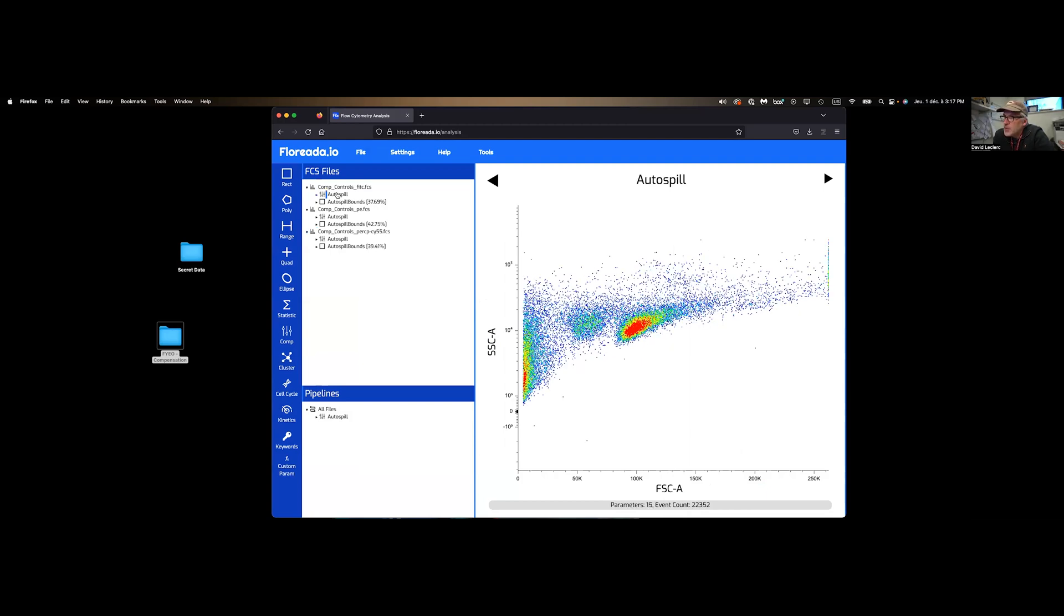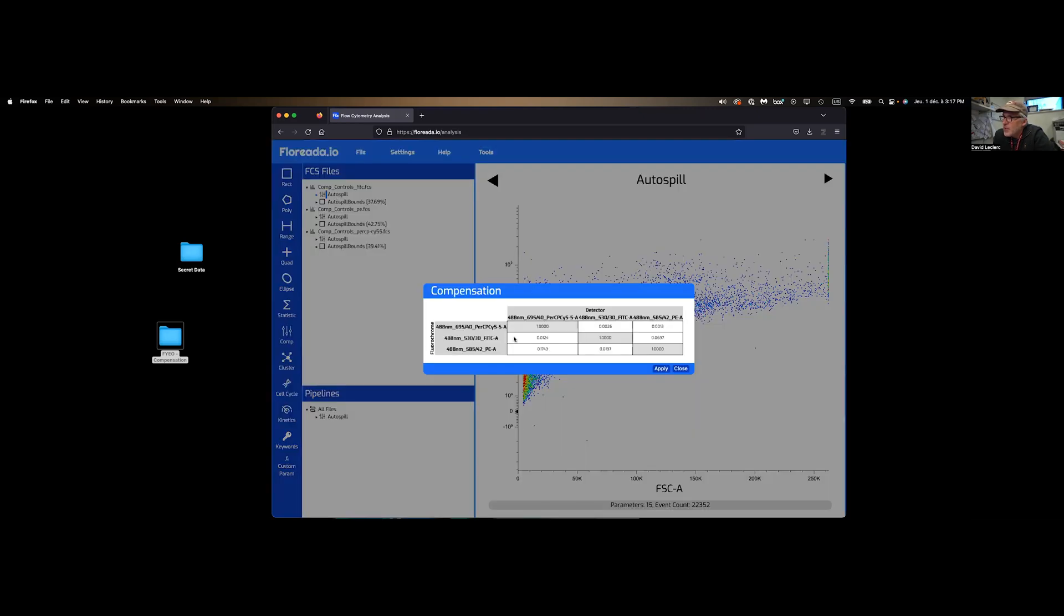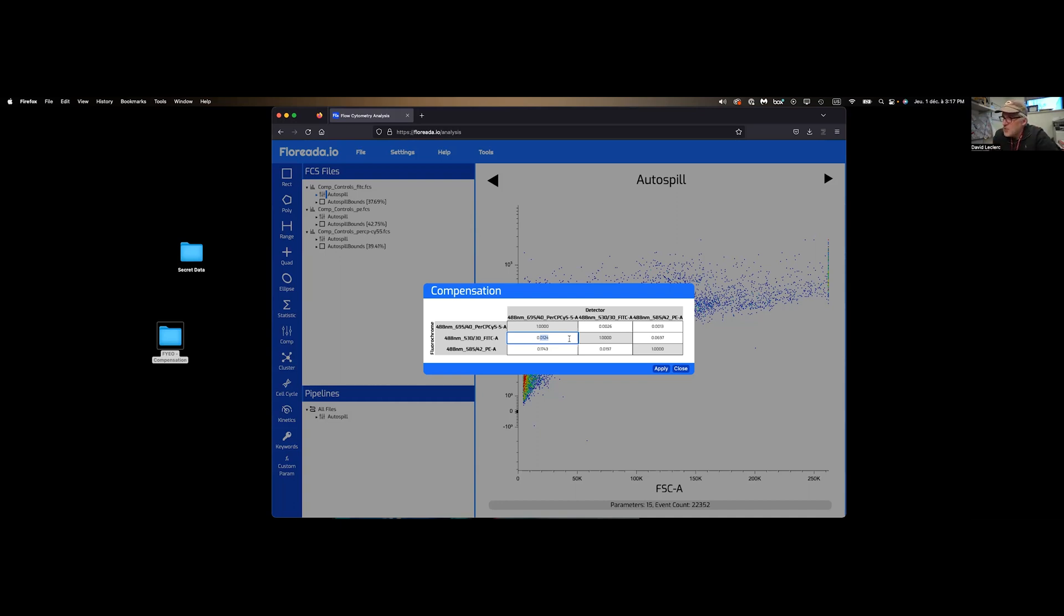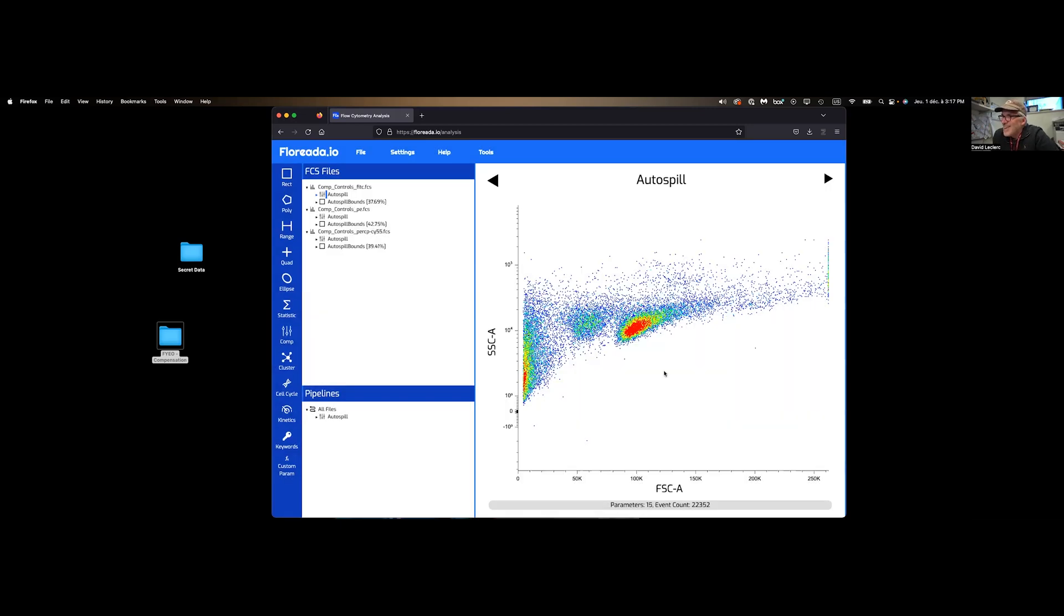If you go to Autospill on any of these samples, right-click and click on Details. Now you have your compensation matrix, and you can double-click on it and change the values just to make sure that you have supremacy over the machine.